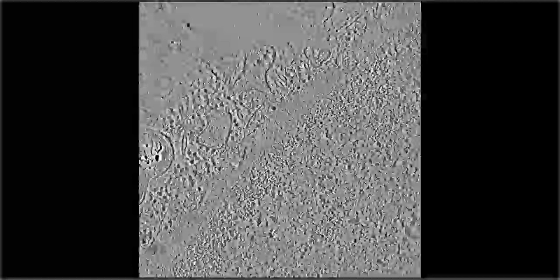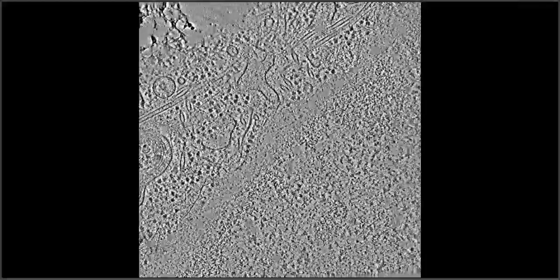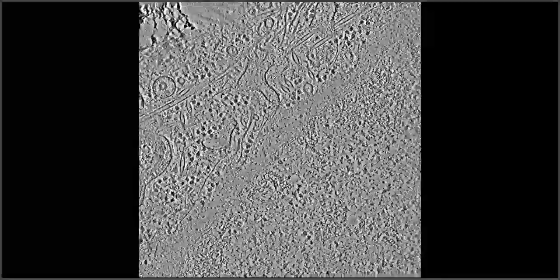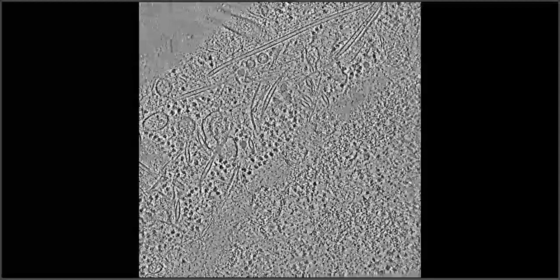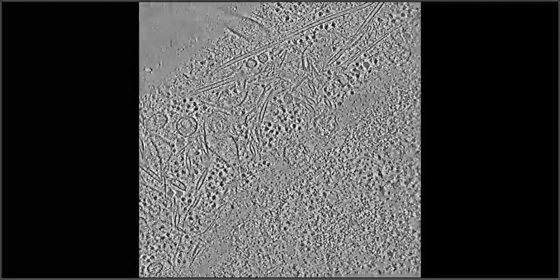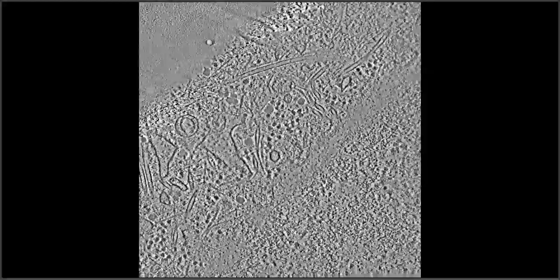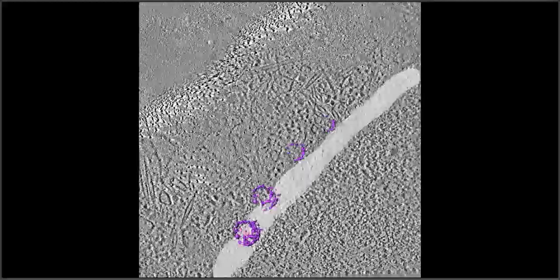And you'll see a whole bunch of biological entities out there in the cytoplasm: microtubules, ribosomes, actin and intermediate filaments, different vesicular bodies. And so what she's going to do now is she's going to go through and segment and identify each of those components for you. So there's the nuclear pore complexes in the membrane, the ribosomes, different membrane components, the microtubules, and then we're going to see the actin and the intermediate filaments pop in, and then lastly the chromatin. And now we removed the imaging, and now we have a map of all the different components within the cell that we can identify.